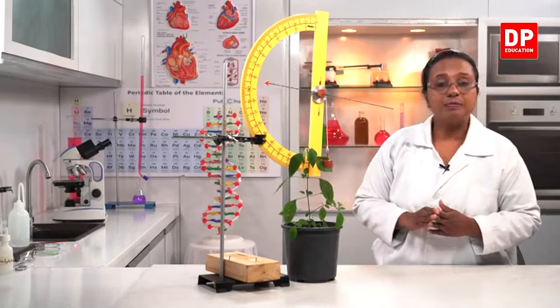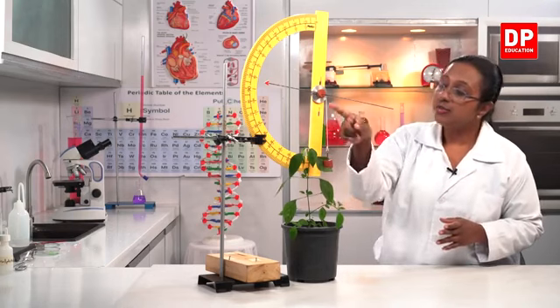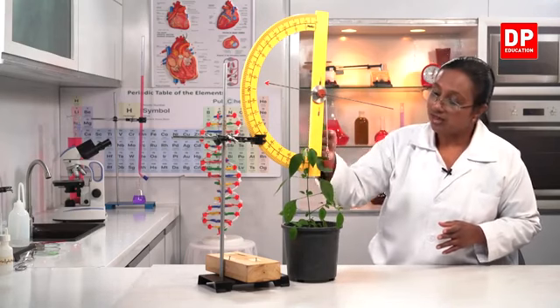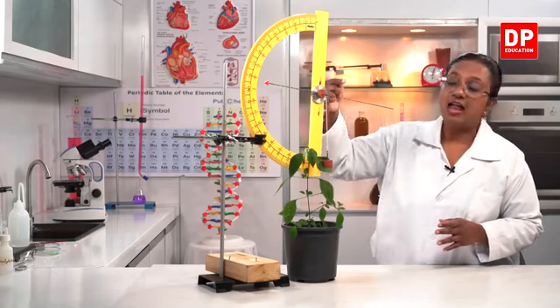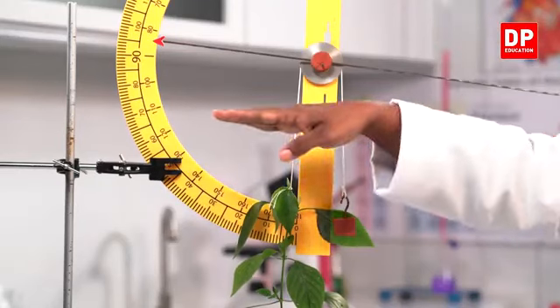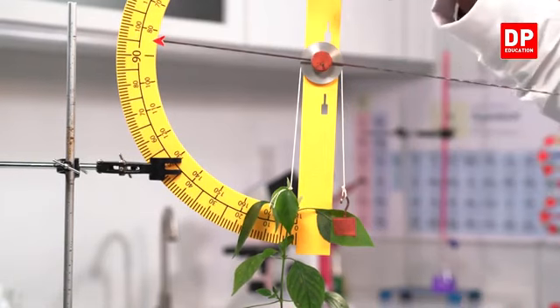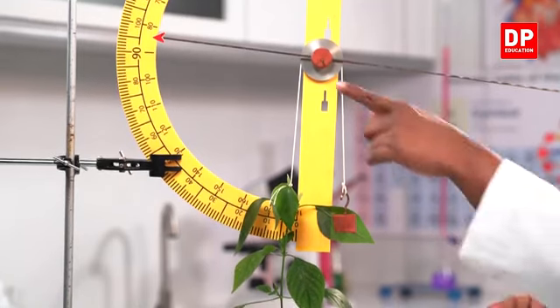So what will happen now? The plant will grow, the height will increase. Because of that, the thread will move down. Because of the weight, it will always be straight, so the thread will move down. With that, the pulley will rotate. And when the pulley rotates, the arrow attached to the pulley will move. And that is the indicator or the pointer here. You can say it's a pointer, and there is a red colored arrowhead there, so that shows the scale.